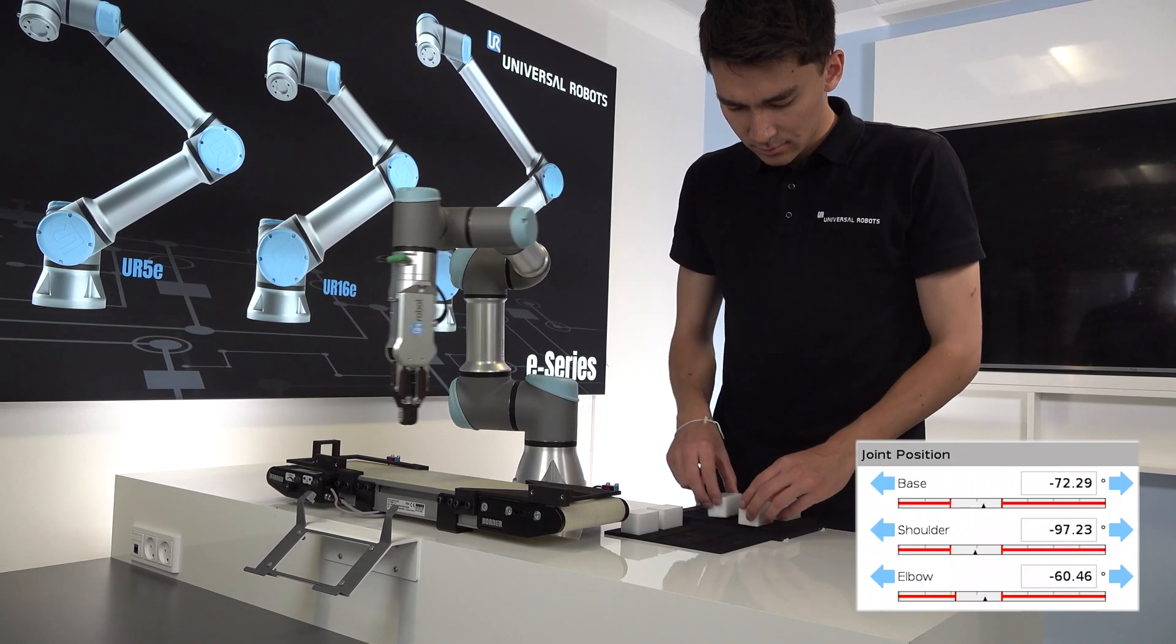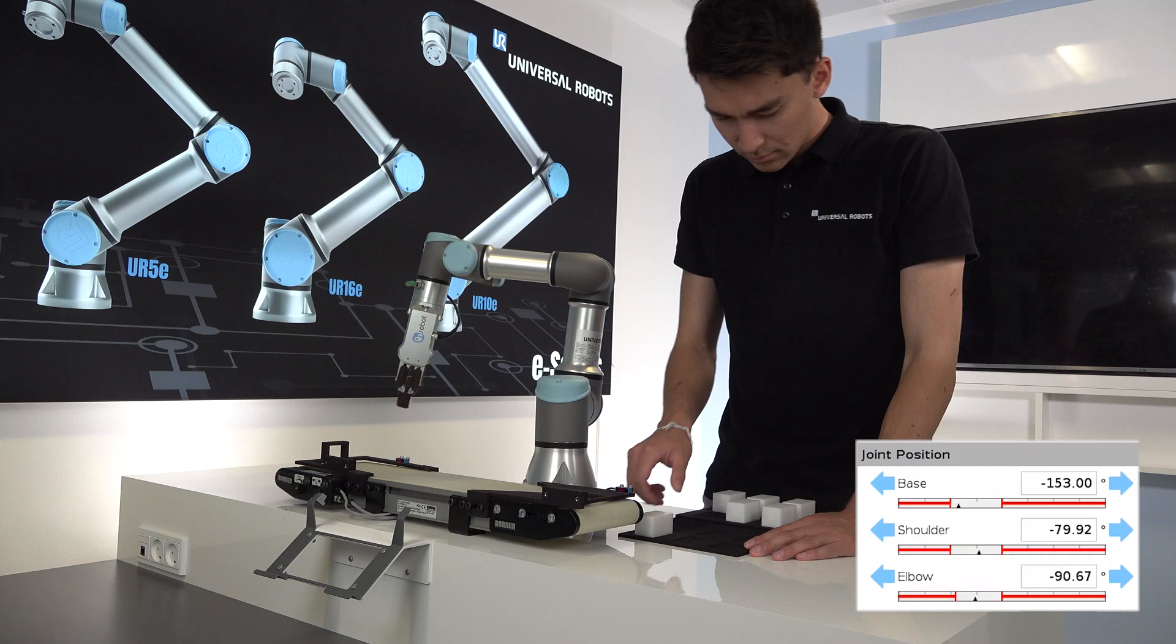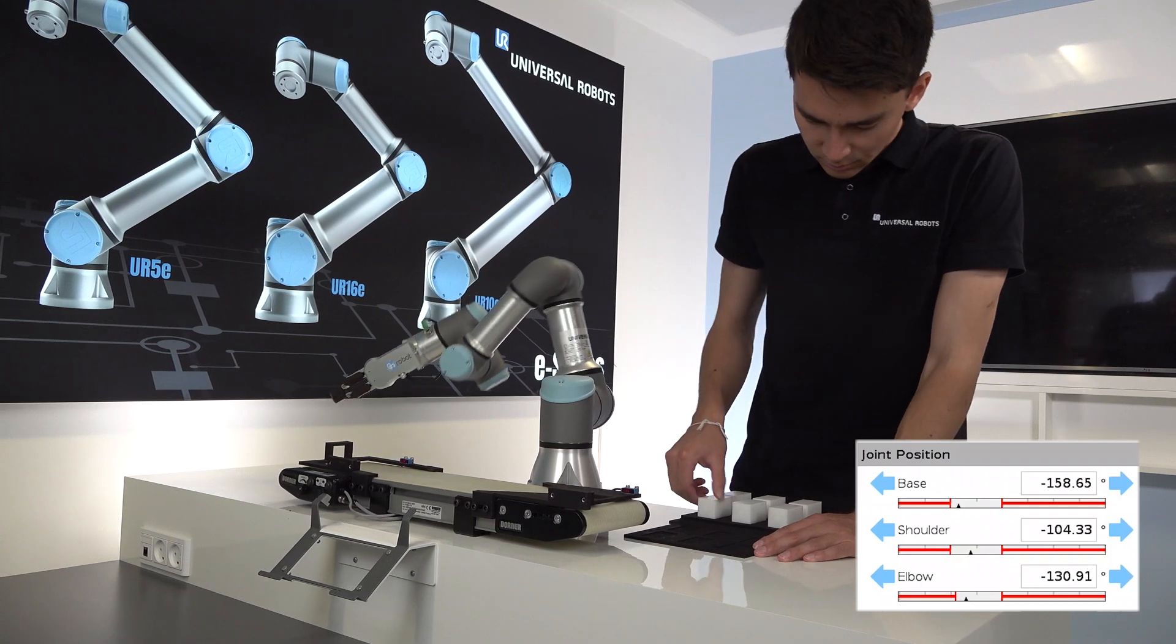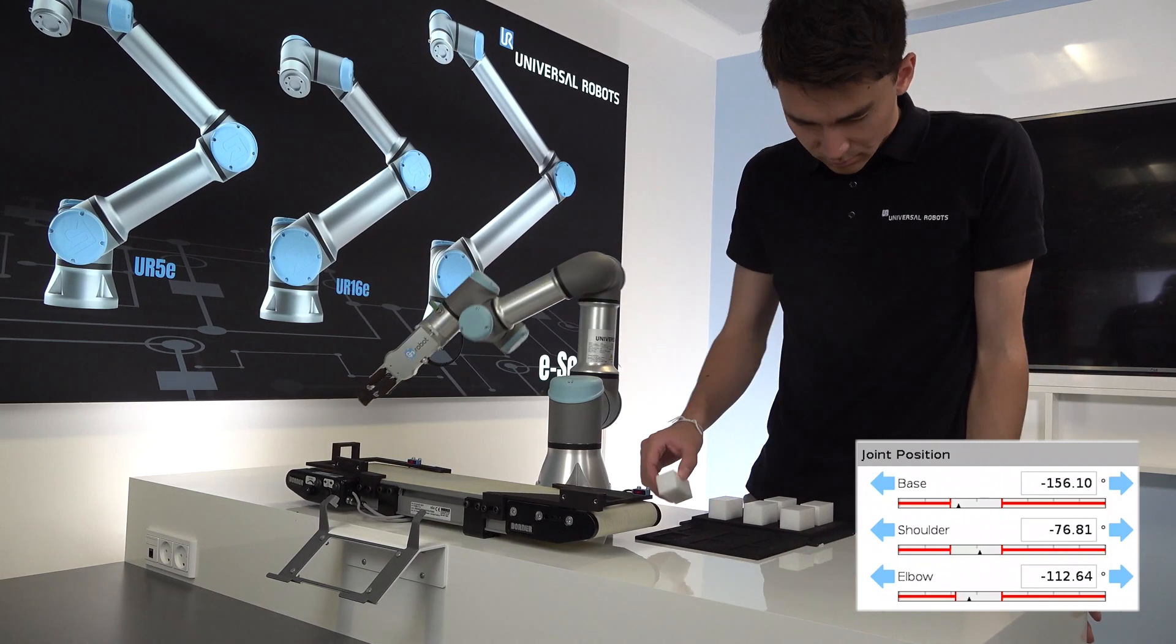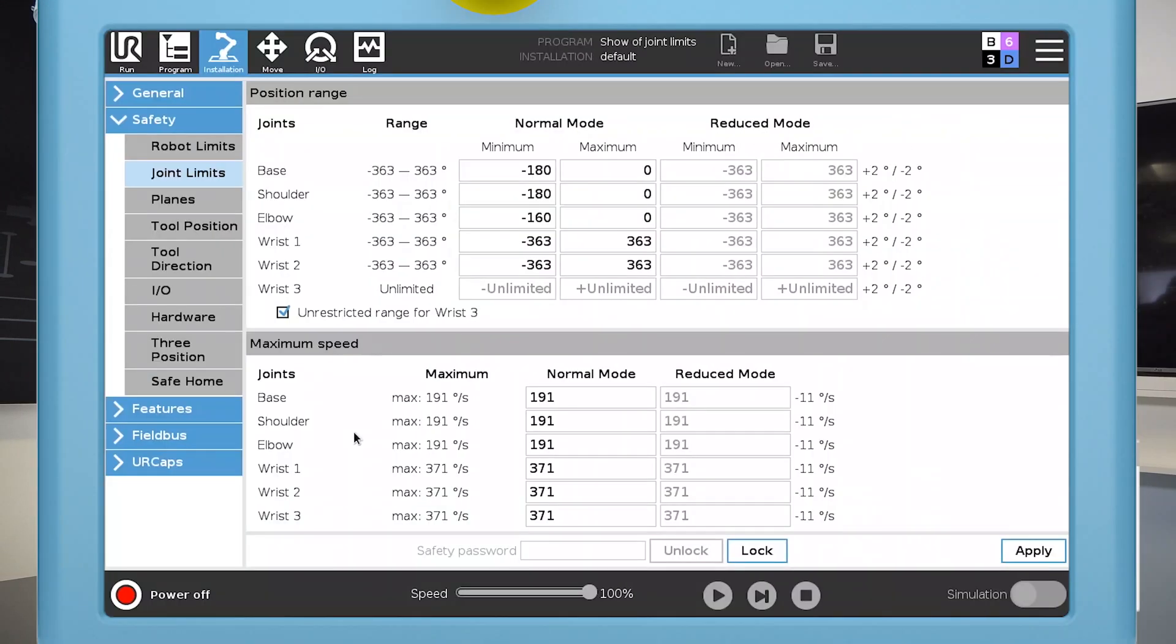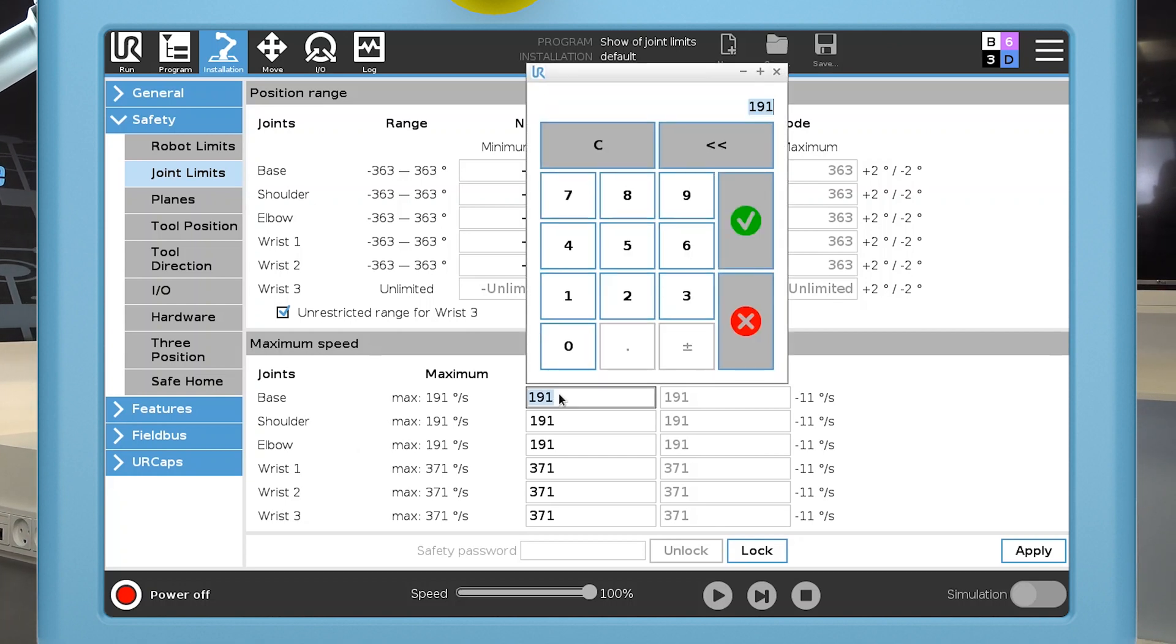In the joint limits menu, you also have the option to limit the maximum speed of each individual joint. I'll limit the speed of the base joint to 30 degrees per second.